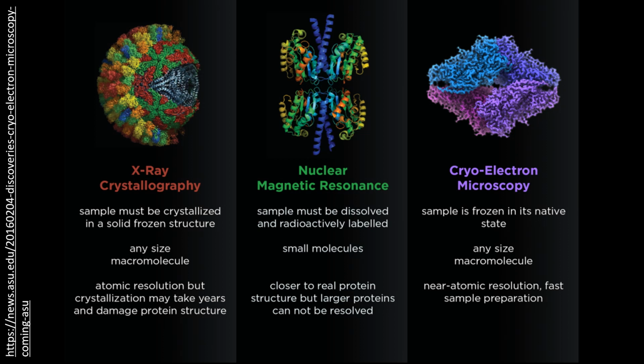While I already compared the technique to standard TEM and SEM, I'd now like to compare it to two other techniques for examining the structure of samples such as proteins. The first is X-ray crystallography. Protein molecules or other molecules are crystallized. An X-ray passes through the crystal, producing a diffraction pattern. Algorithms are used to determine the location of each atom in the protein from the diffraction pattern.